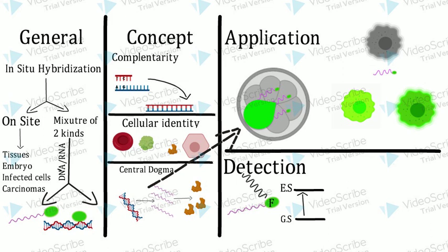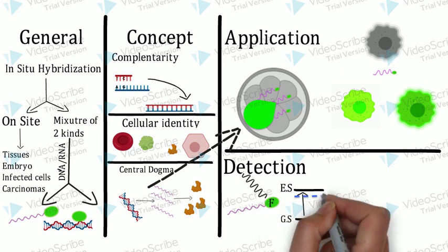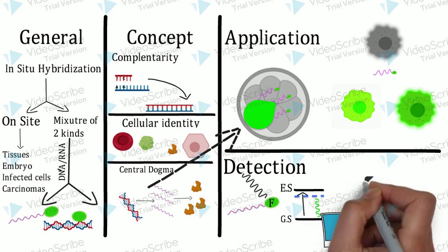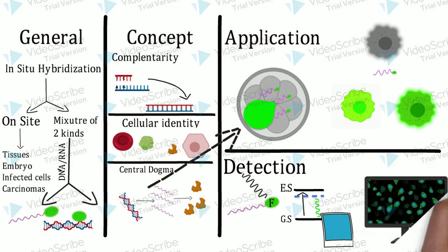This is followed by the electron returning back to the ground state, emitting light, and exhibiting a phenomenon called fluorescence. This can be recorded on the detectors of your camera, which then can be seen as fluorescence signal on your computer. Now, images of fluorescent signals are very pretty and beautiful. I have to admit, this is one of the reasons I love doing my work.